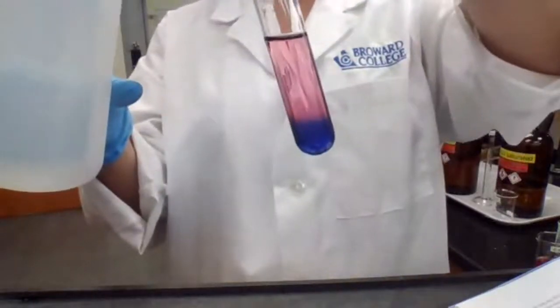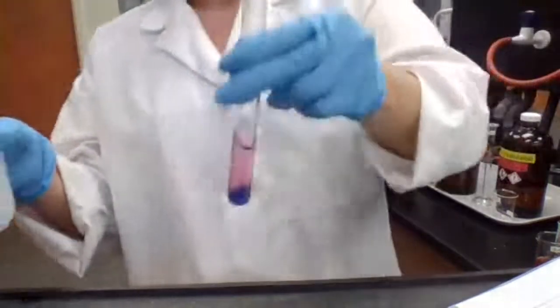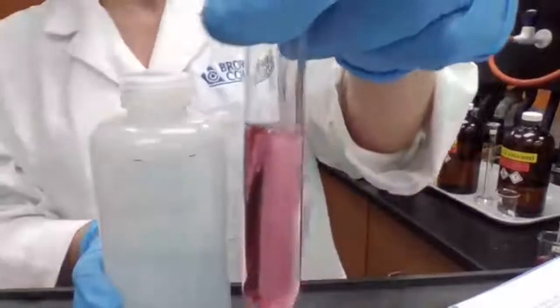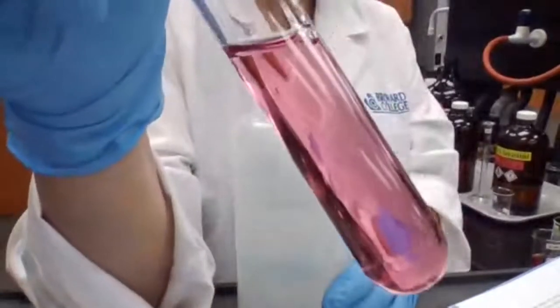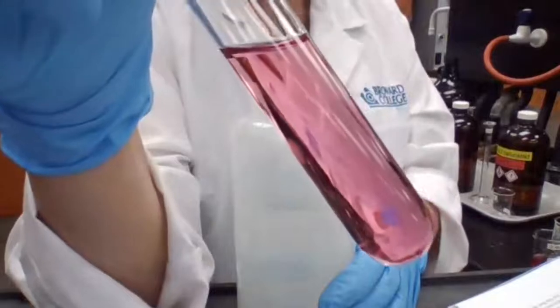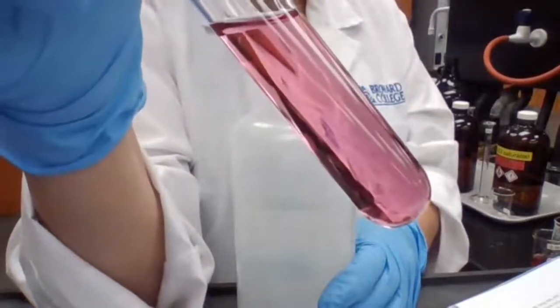It's actually changing color. I'm going to add enough, and I want you to record the color after adding deionized water. This is for part B of the experiment, the cobalt equilibrium.